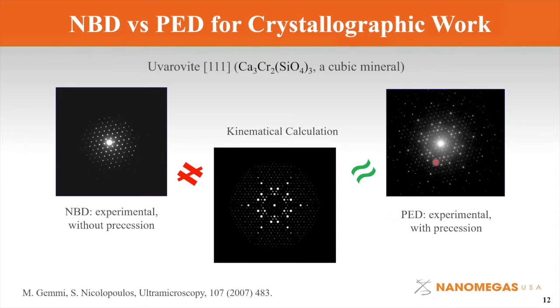First, the dynamic effects are averaged out to a certain extent, and second, higher order Bragg diffractions are excited and recorded compared to patterns without precession. Precession patterns like this make the data analysis easier and make automation of reliable data analysis possible. So now we have learned the power of precession.